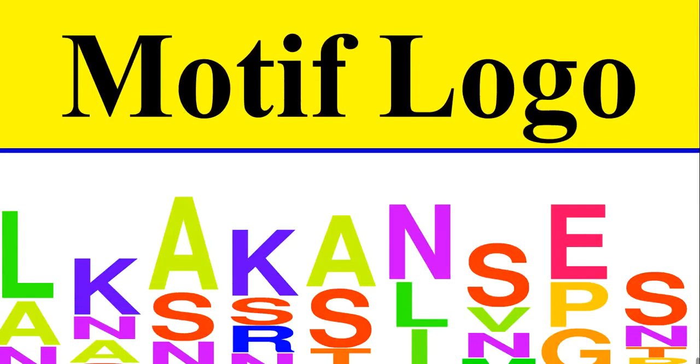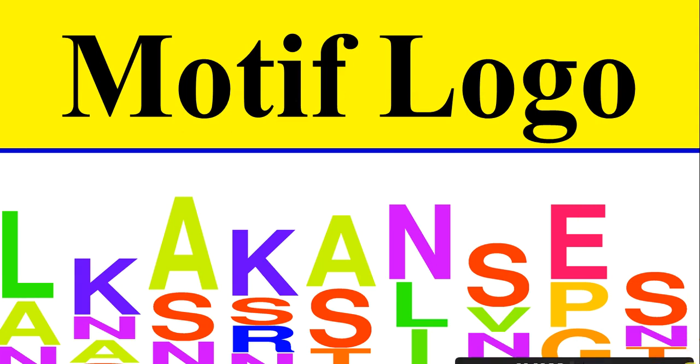In this video we will try to learn how we can prepare the motif logo of our gene or the conserved motif or the most important motif in which we have the domain of our gene and we want to show them as a signature. Let's start.